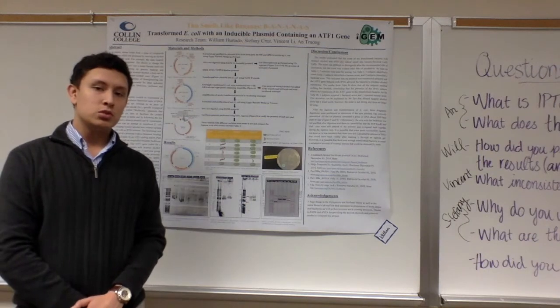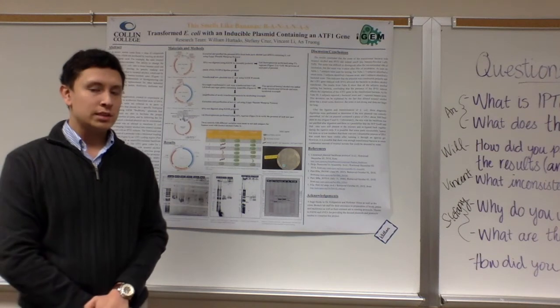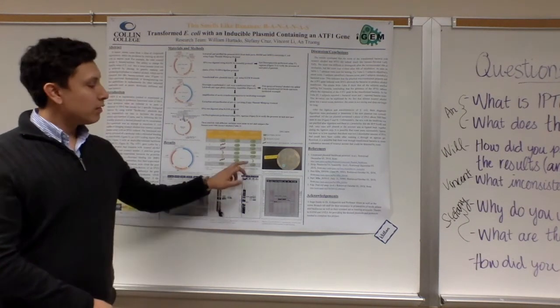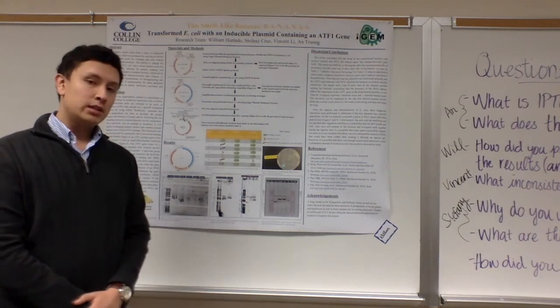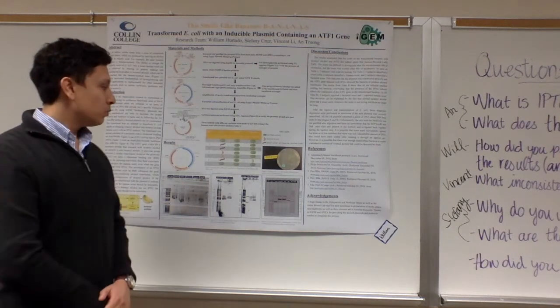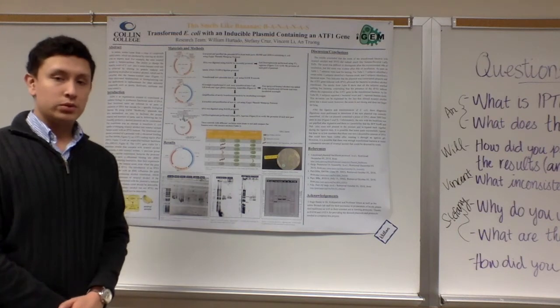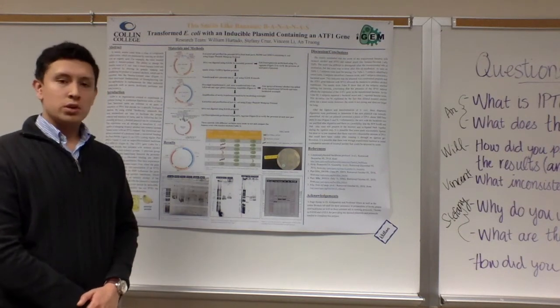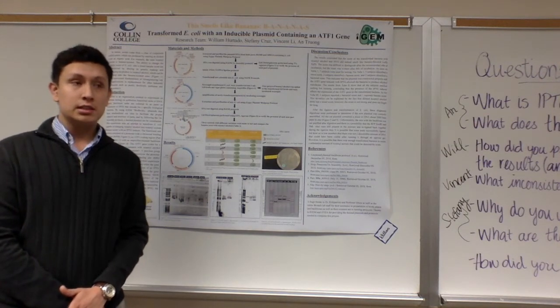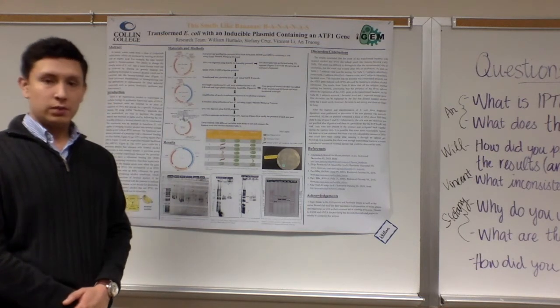Between each tube and each trial of our sniffing test, we had our subjects smell some coffee beans in order to cleanse their palate. Although the majority of our results were consistent with what we expected, we did have one person who smelled bananas in the tube that was untransformed bacteria with IPTG and alcohol. And we did have a couple people who did not smell any bananas, who actually smelled bacteria in the tube that was supposed to smell like bananas. Further questions from the sniffing test, such as any allergies, any congestion, any sickness, could have helped us in determining why they smelled different stuff than what we expected.